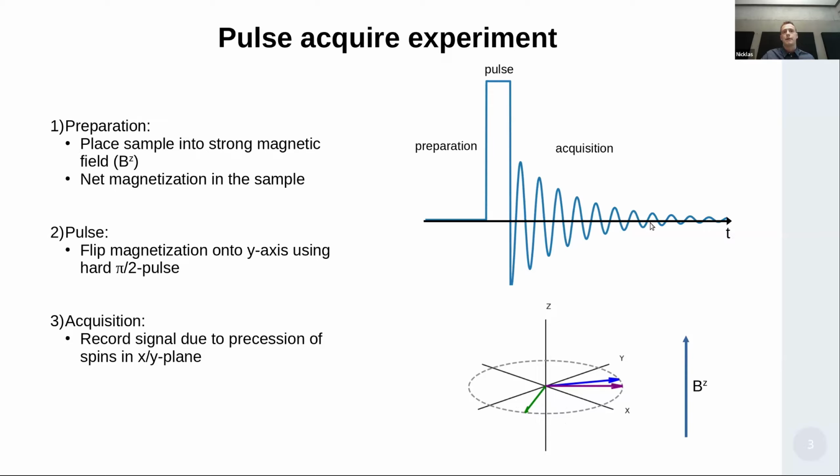As I just said, this is only one of the experiments that you can run. There are a host of other experiments that you could do. This field is extremely old, actually, like 70 years or something like this. And from spin echoes to 2D NMR, there's a lot that you can do. We are currently in the process of finding the most valuable candidates to extend our toolset to. So if you have any ideas or features that you would like to see in our software, feel free to contact us. We are always happy to get this kind of feedback.